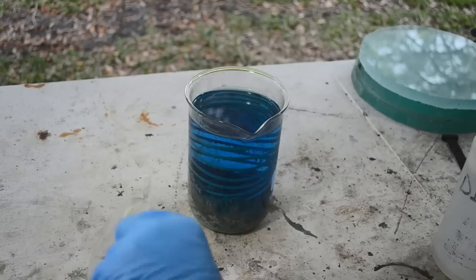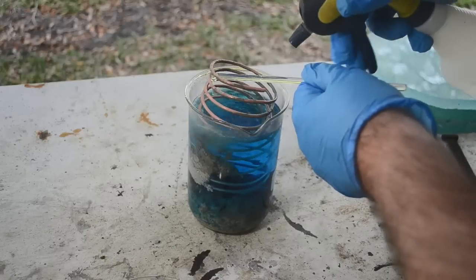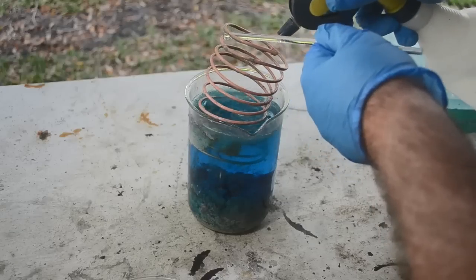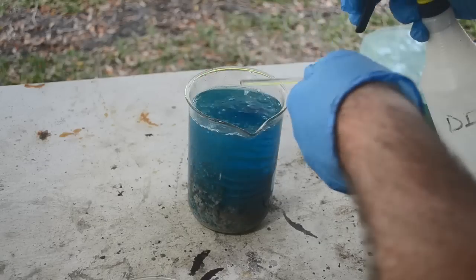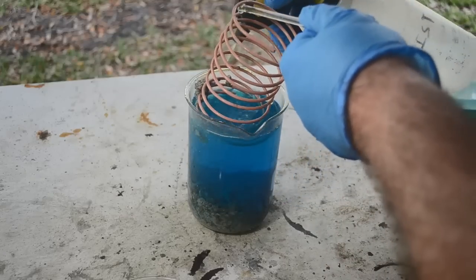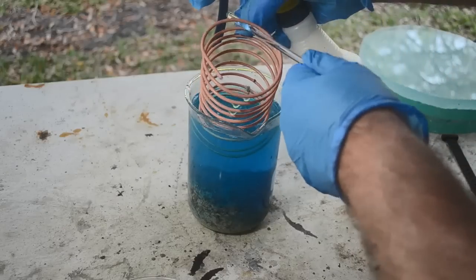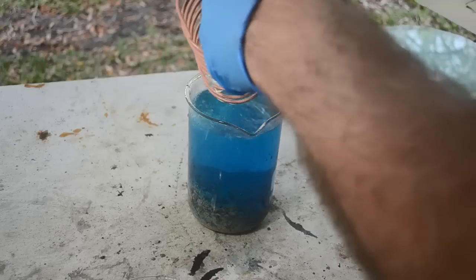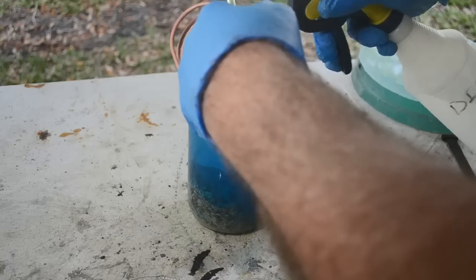Okay, let's see if I can get this out of here and get silver off of it. Oh yeah, nice shiny copper underneath that silver. Oh, there's a lot of silver stuck to it. Uh-oh. Well, that didn't help. Come on, everybody into the pool. Okay, that copper's reusable again. There's a lot of metal left on here.